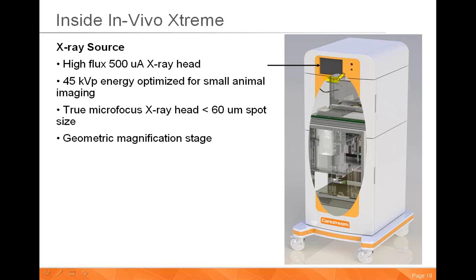That would be located up here, and that would then not be able to be co-registered with fluorescence and X-ray. If you acquire X-ray images here at the platen, then you can co-register any of the different modalities with X-ray.